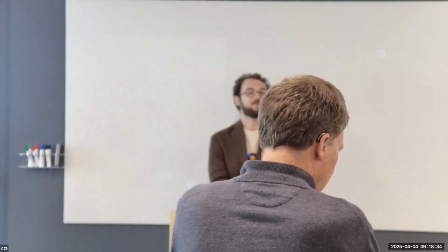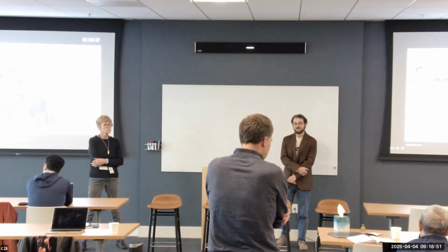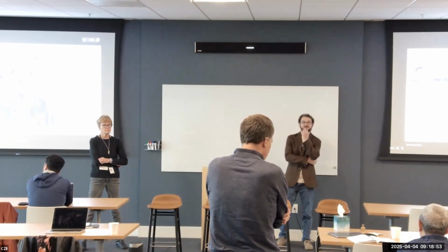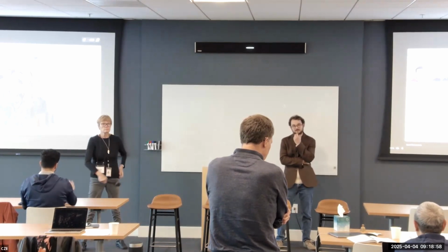Yeah, very nice talk. I'm super excited that TomoTwin works so well on the phantom data sets. So here is a request and also a comment. You mentioned that TomoTwin is not designed for membrane proteins. I still want to know, with the current form, what can we do for TomoTwin to detect the membrane proteins? Yeah, so that's the first question. Sorry, I have a second one. And the second one is, how does TomoTwin generalize on different pixel sizes?